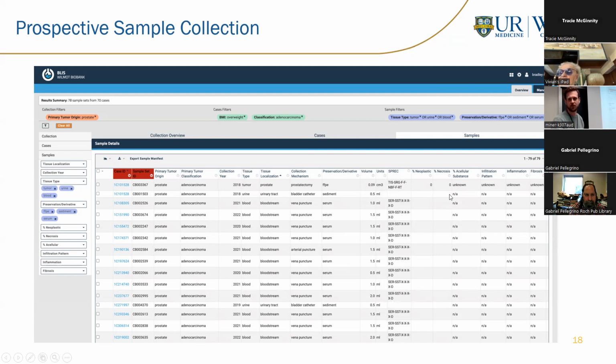for reporting in publications. And on the right, we're beginning to annotate this more and more, but really from our FFPEs, for every tissue we collect, we want to have an idea of, okay, in this tumor, here's the neoplastic content, here's how necrotic it is. So when you get a tissue sample, you're not just getting a 90% piece of dead tissue that is generally worthless.